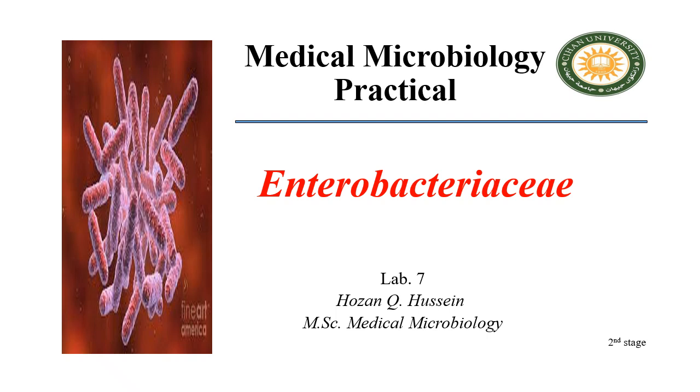Good day. In this lab, we will discuss one of the most important families of gram-negative bacteria, Enterobacteriaceae. These bacteria are commonly found as a part of the normal flora in the intestinal tract. However, some species can become opportunistic and cause infection. This family includes many medically important species such as E. coli, Salmonella, Shigella, Klebsiella, and Proteus. By the end of this lab, we will understand how to identify these bacteria using culture characteristics and biochemical tests.